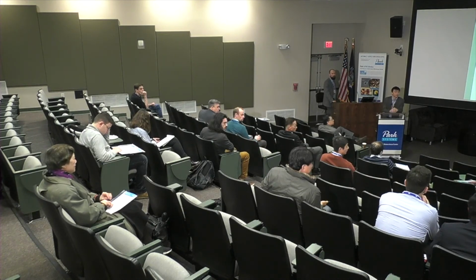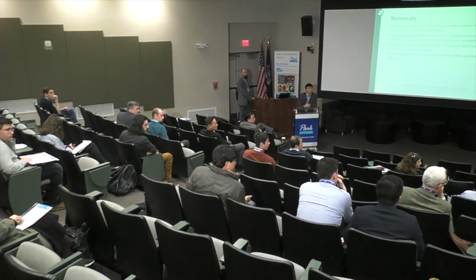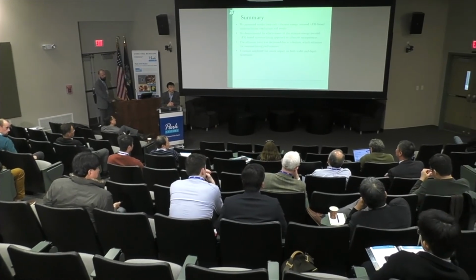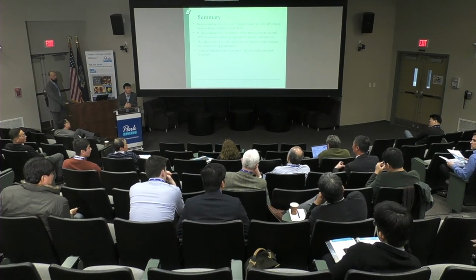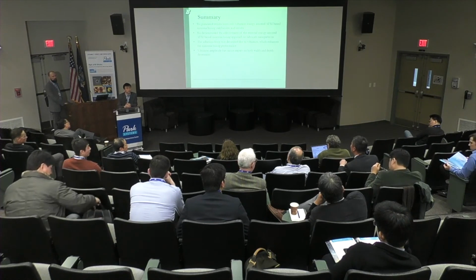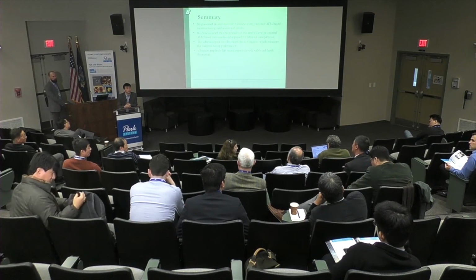We are supporting some customers who are trying to use our AFM for mask repair. The challenge there is nanomanipulation, moving nanoparticles from one place to another. The name of the game is to use a minimum force, so that we don't damage the very expensive mask surface. Have you tried this vibration-assisted technique for nanomanipulation?